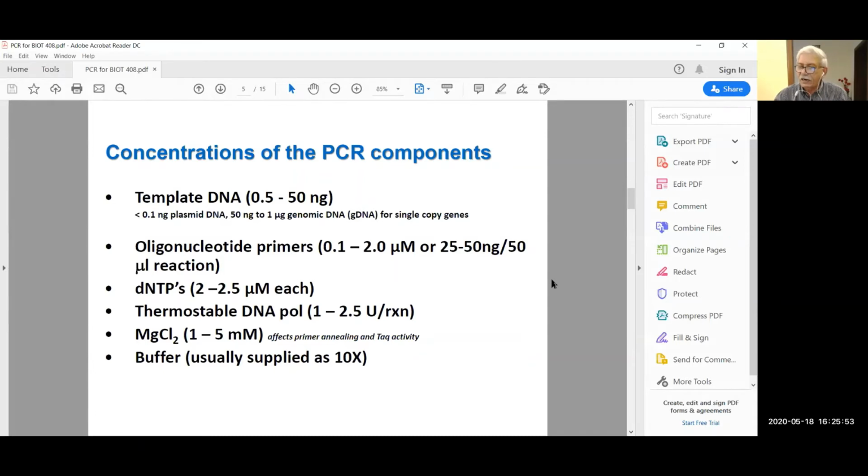And this is the heart of PCR. Okay. If you understand this, I would say that you are not a technician, you are a real scientific personnel. Okay? Now, I have mentioned it several times that when we are on an interview table, either it is a viva or it is an interview table, we ask the candidate how you set up your PCR reaction.